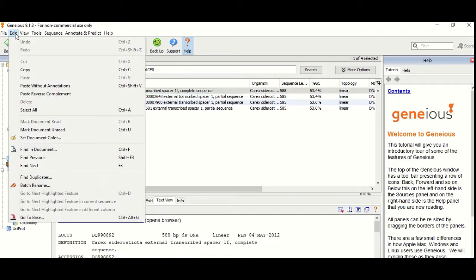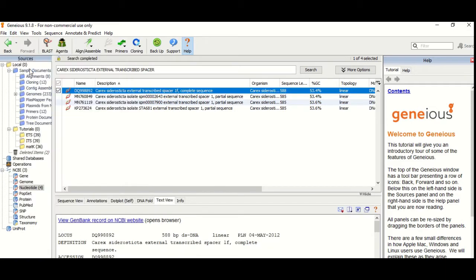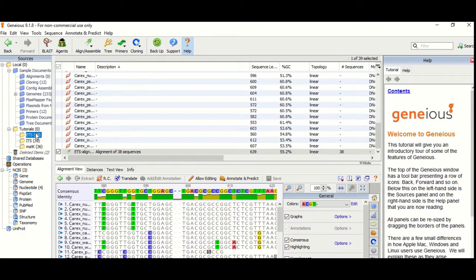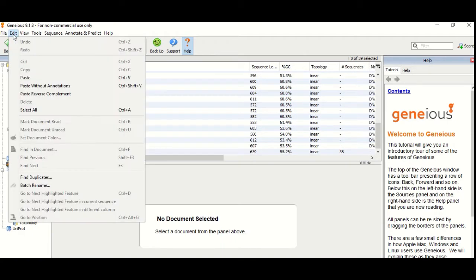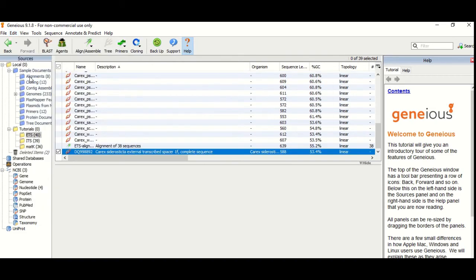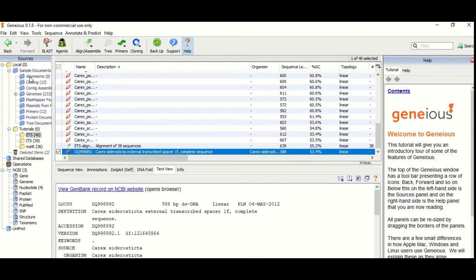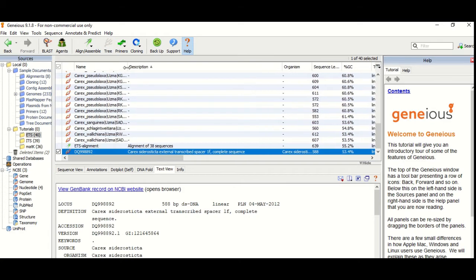Go to Edit and copy the sequence. Then go to alignment options and paste it. There are other regions available such as ITS and matK.